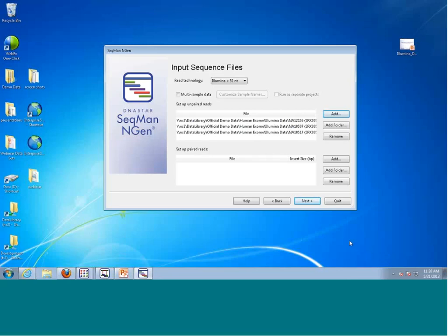And I like to keep my data separate on one drive, and in this case it's up on my network. And I have a temporary drive to handle the temporary files, and then of course my operating system runs on the C drive. And in that configuration, I can get the best possible performance out of the assembler.